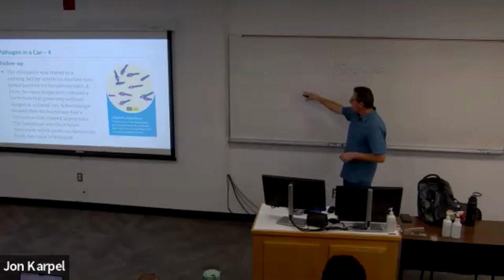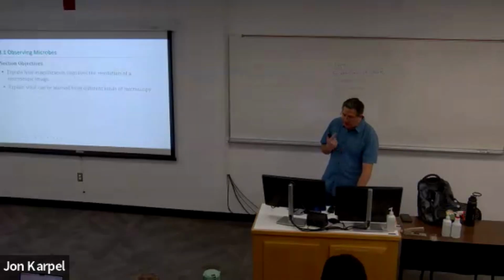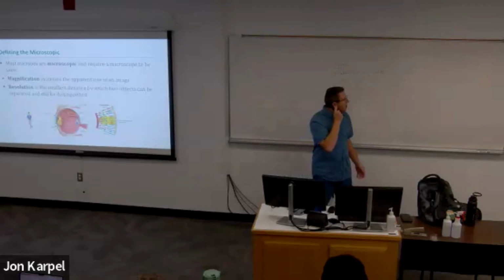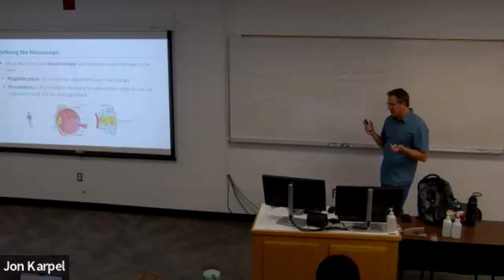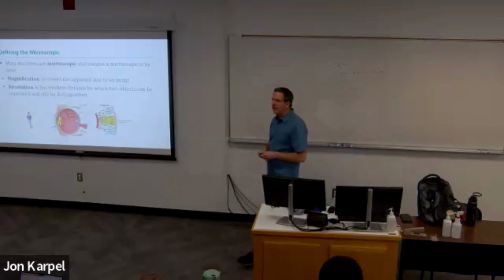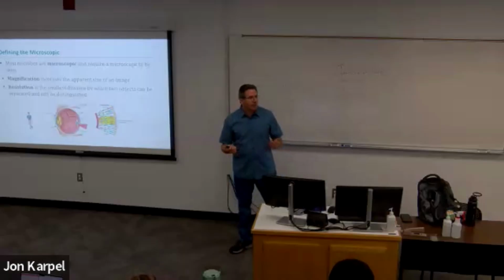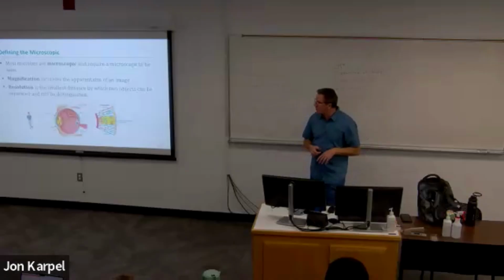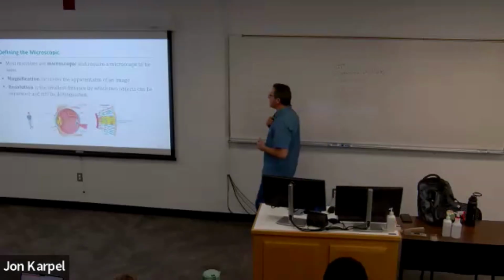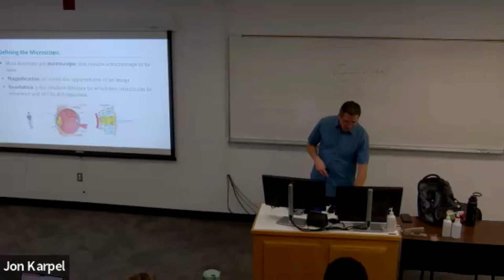So that's really the point of this whole class today, is to convince you of that and see how they work and how it helps us, right? So there's some terms. Most things that we're looking at are microscopic, so they're too small to see with the naked eye. We could barely see some of the largest eukaryotic cells, but most bacteria are under the limit of what we can see. So of course, we use microscopes to magnify and resolve these structures.